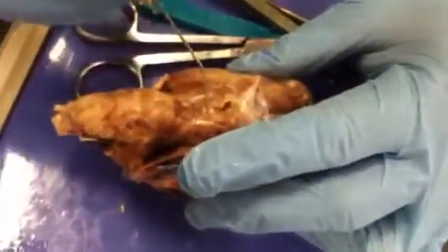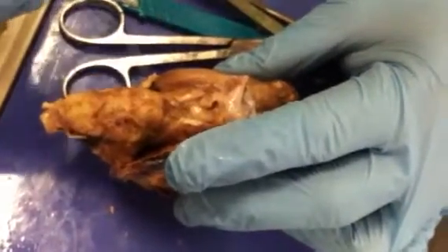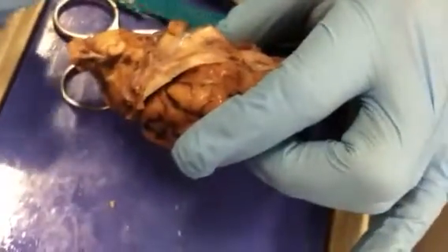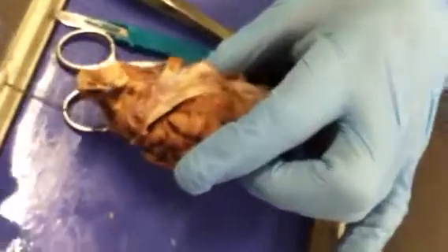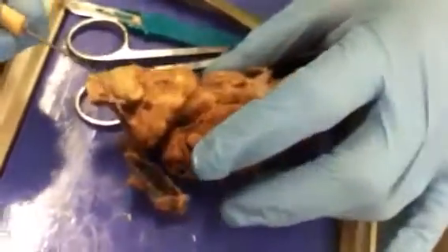And that's where we got the oculomotor. Okay, right there. And then here's the trigeminal, which is covered in a thick sheet of dura. It's the trigeminal. And that was connected right here. We had to cut that off to get that out.